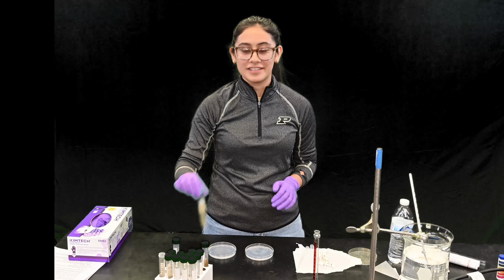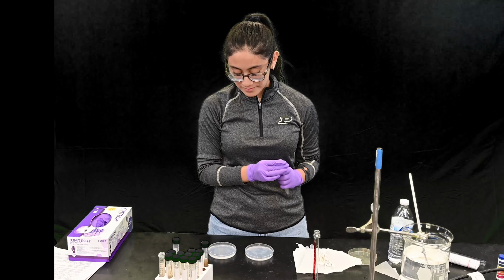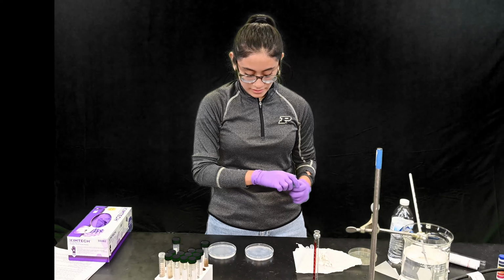Okay, now we're going to plate our dilutions. We're going to start with our dilution number 2. Make sure to name your plates before. We are just going to add 5 drops of our dilution onto each plate. Now we are going to use a Q-tip provided to streak all over the plate.